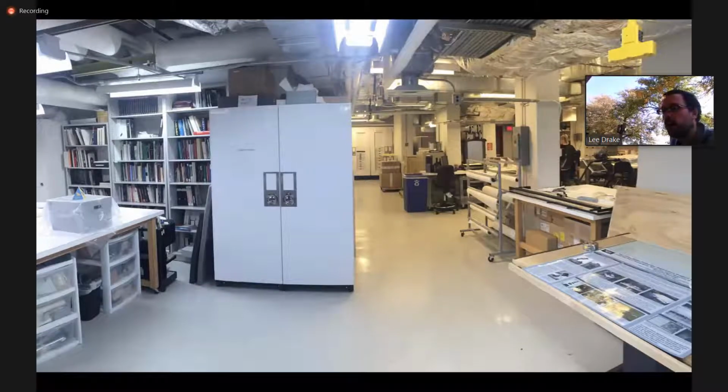If we look over to the far left, you can see a little blue triangle sitting on the table on top of a box, and it's a very bright blue. The reason the blue comes better through the full fluorescent view is because higher energy photons in the ultraviolet range are actually getting through from that light bulb. So as a result, we see the full spectrum of color.